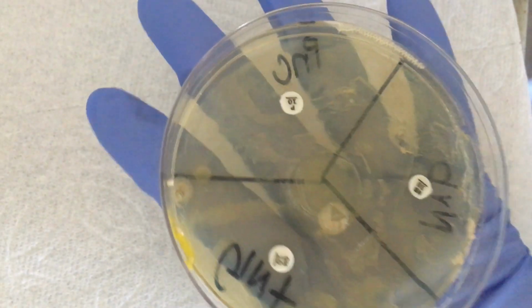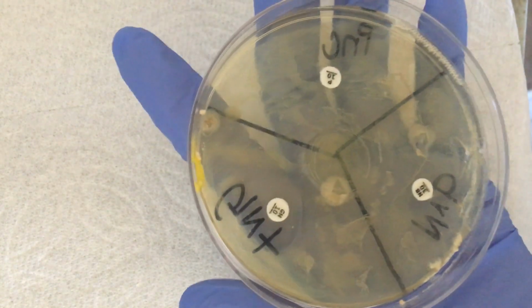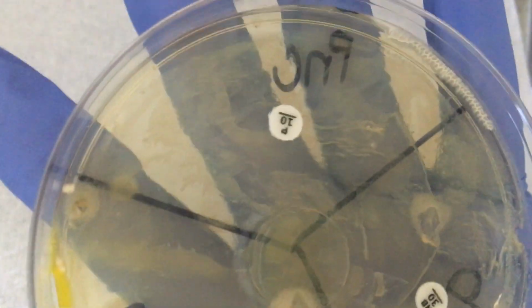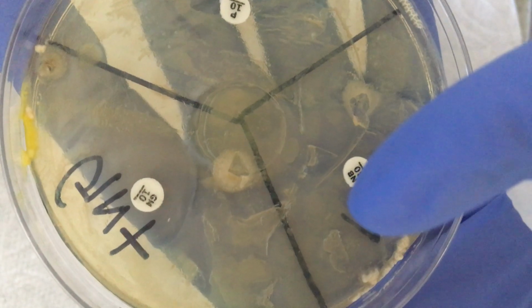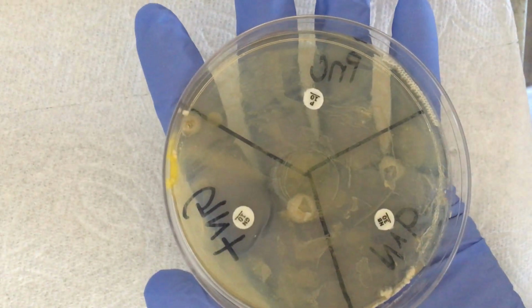So I have to say, what the heck did I do wrong? Because I definitely didn't think that was going to be the answer. But there is inhibition of growth. And I noticed these 2 didn't do too much. This one has a little inhibition of growth on the side, but not much. So I'll definitely report this.